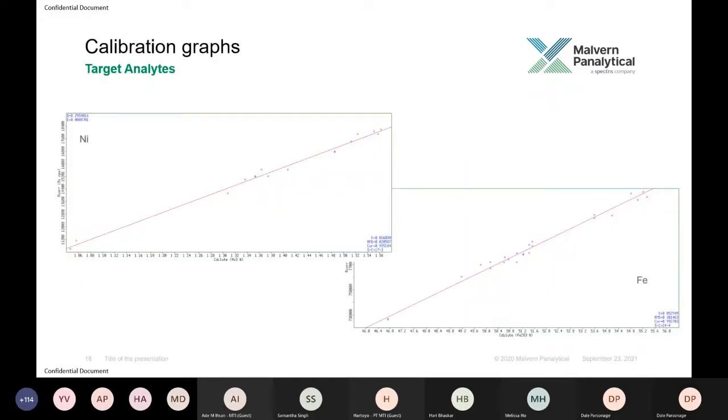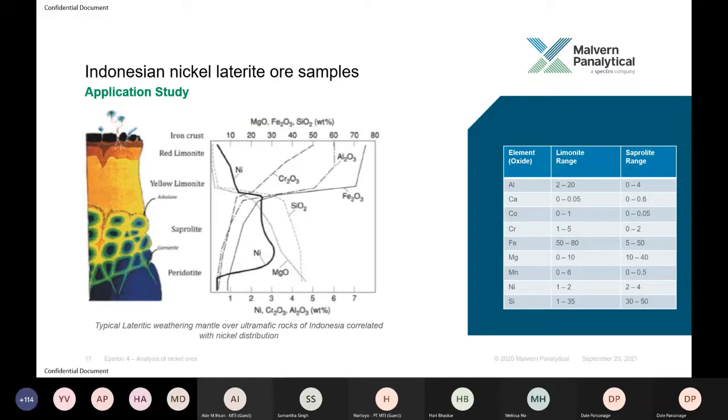So from this material, I set up a calibration and application for the two types. For the limonite material, which has a lower magnesium concentration, I set it up both with and without the helium, and I'll discuss the different implications on precision and accuracy.